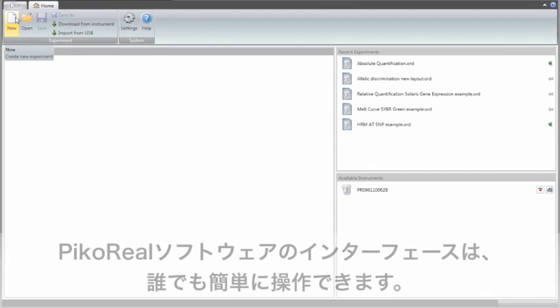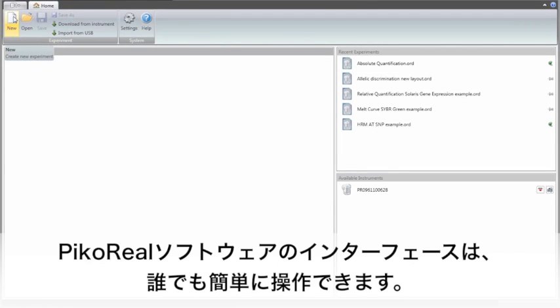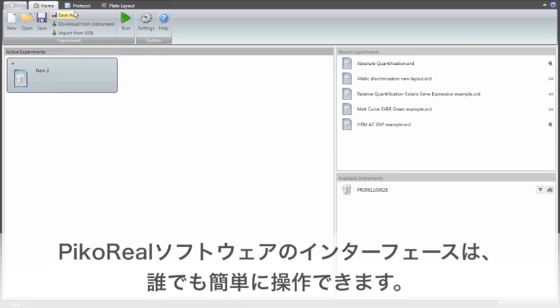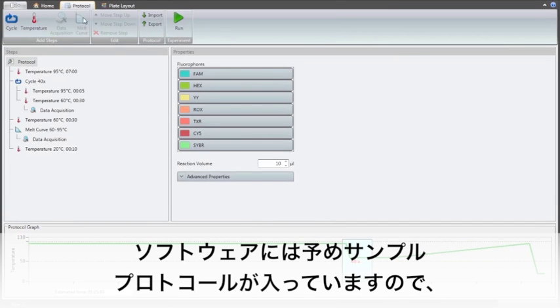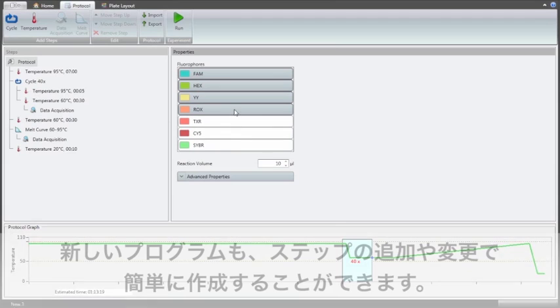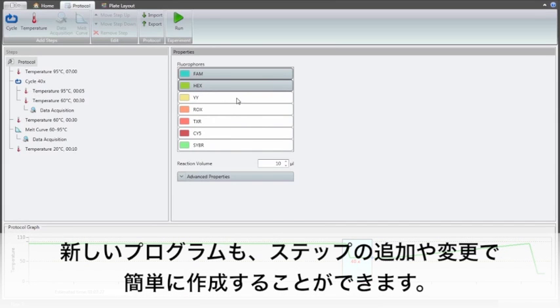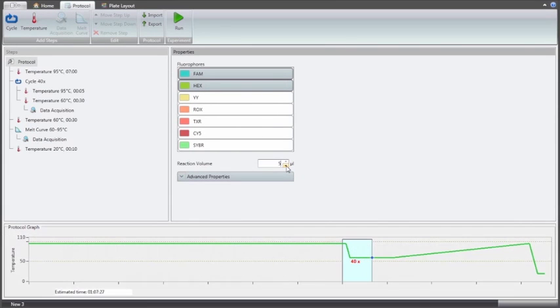PikoReal software has a modern interface with easy-to-use functionality. The software comes with a set of ready-made protocols that help in programming, and adding or modifying steps takes only a few seconds.